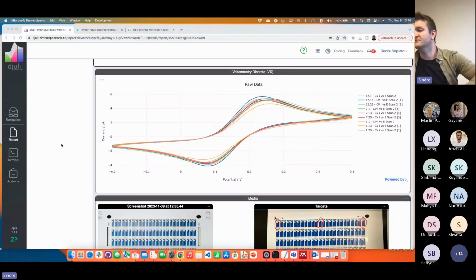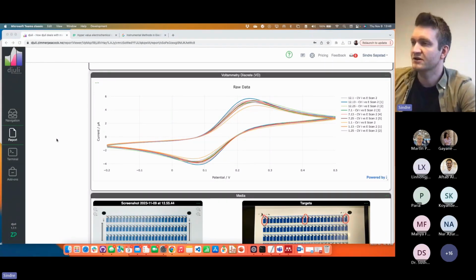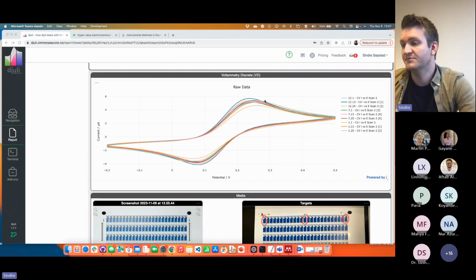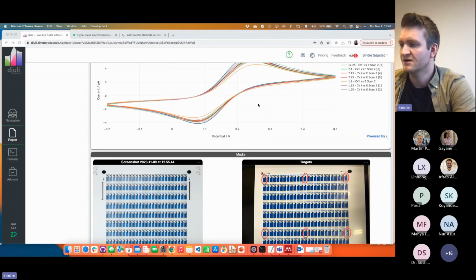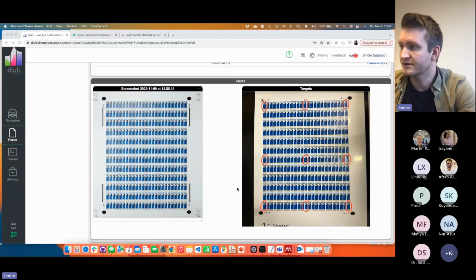And yet again, we're seeing some voltammetry data. In this context, I want to talk a little bit about how to treat lots of data in a fairly standard way so we can save time. I have some data here, and this is something we typically do when we're doing manufacturing runs. We have our electrodes. This can be screen printed electrodes. This can be wires, but they can be laid out in a format such that you can coordinate to these sensors using space coordinates.